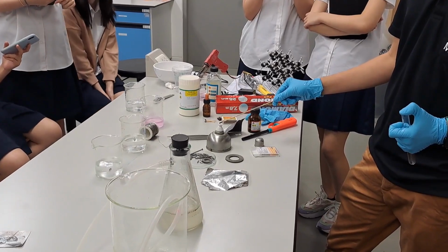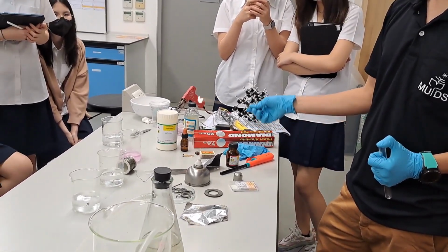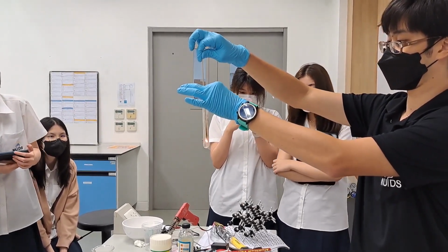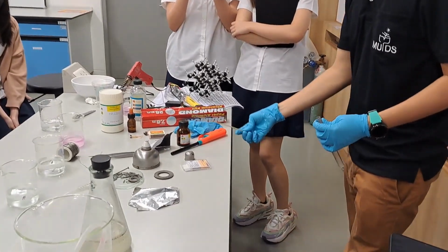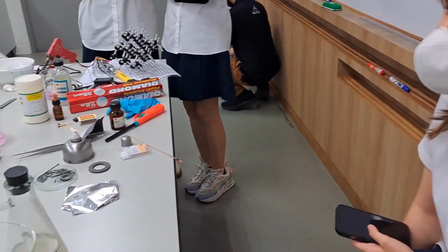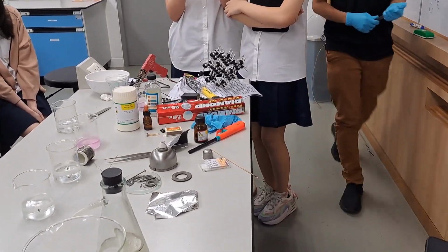Now I will burn this up, and you will see what happens if I drop this burning stick into oxygen. 1, 2, 3. All right. Is that flammable? Maybe not, unsure. Is it flammable?